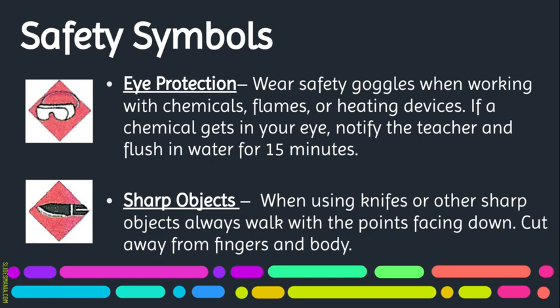Accidents are going to happen either with sharp objects or a spill or a drop or a break. And accidents are okay. I mean, they're going to happen. I'm going to make sure that I talk to you and ask, are you okay? Is everybody okay? Is anybody hurt? Is anybody cut? Okay, go wash your hands. Let's step away and I'll move you from that area and you'll do your lab someplace else in a different part of the room and I'll clean up. And we'll just go about our business.